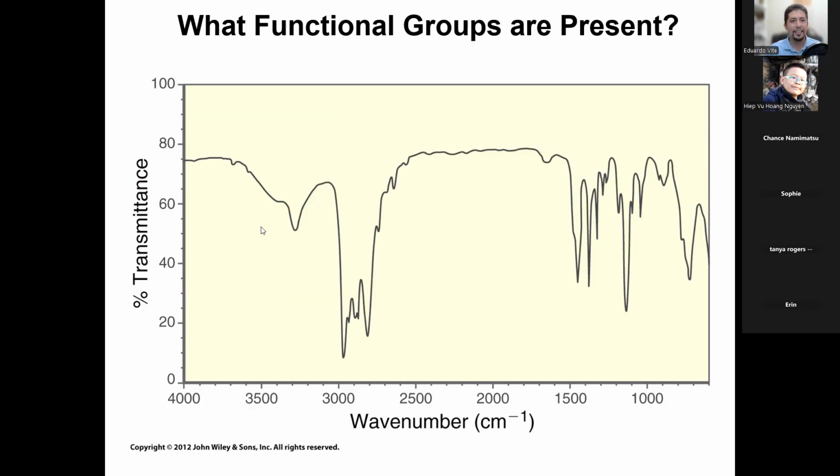Okay, here we go. CH and NH. Again, I need you to be more specific, because what is it? CH like sp2 CH, sp CH, aromatic CH. You need to be very specific when you're talking. It's like saying, what's your name? I'm a human being. No, what human being are you? Secondary amine. That's right.